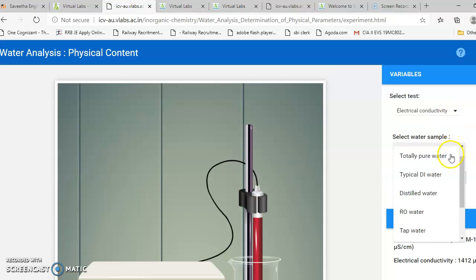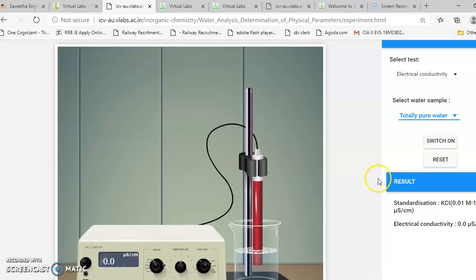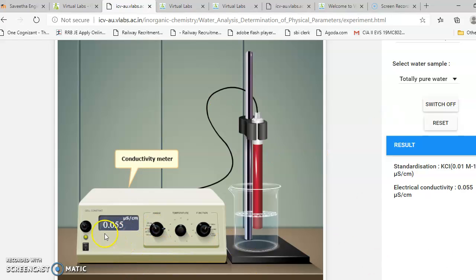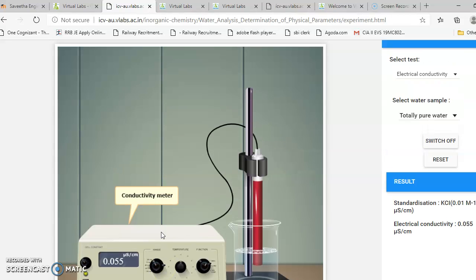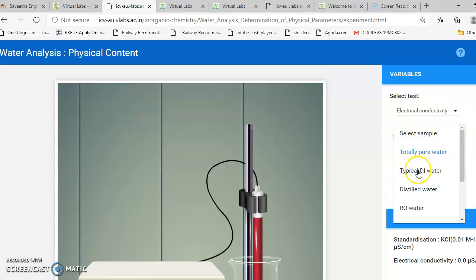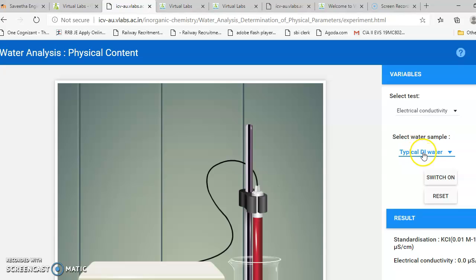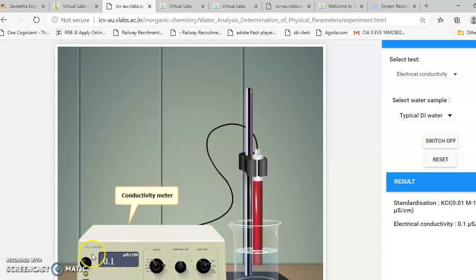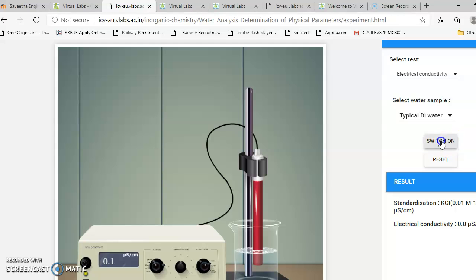If I am taking total pure water, first you select the sample, then switch on the instrument. Once you switch on the instrument, the conductivity will be shown. For pure water it is 0.055 micro siemens per centimeter. Then switch it off and select typical deionized water and switch on — it will show the conductivity of deionized water, which is 0.1 micro siemens per centimeter.